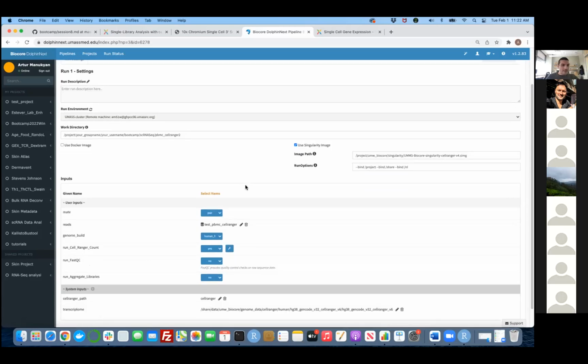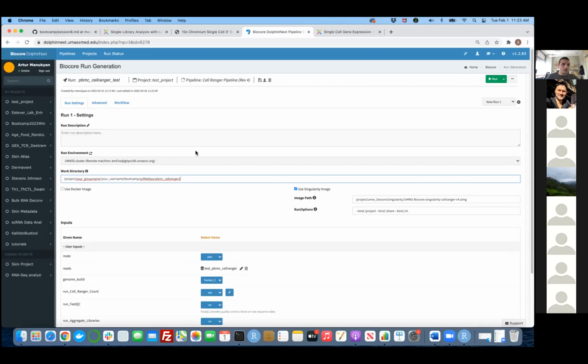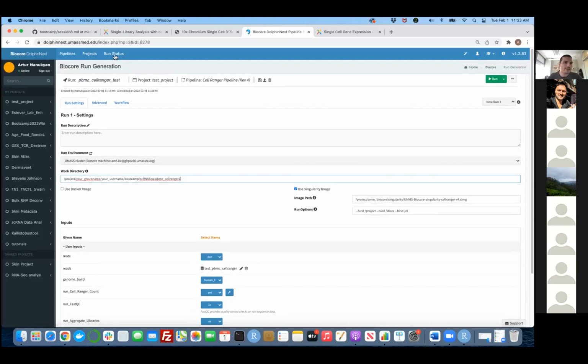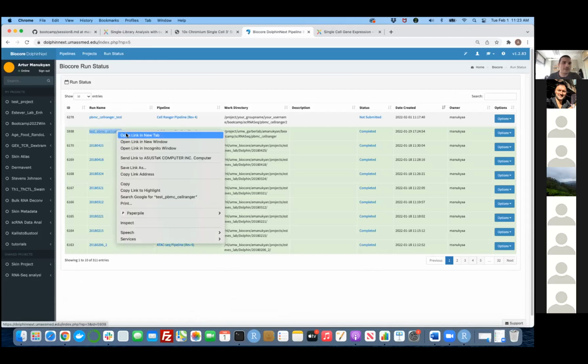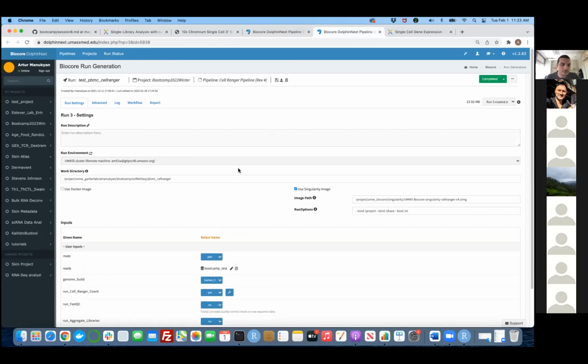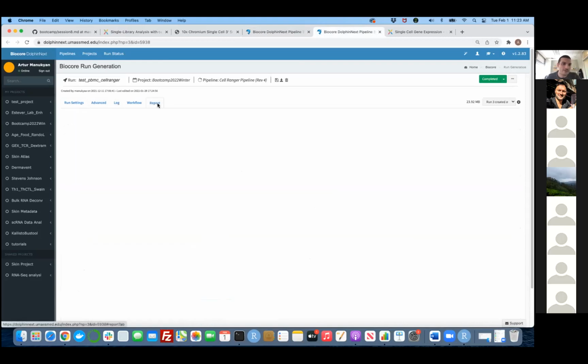Basically, this is a really good example because this pipeline will take 3 hours to run. So I'm not expecting that we're going to get the results now, but we are going to talk about the results in a different way. I already have a pipeline that has the results. So I'm just going to go to that and we're going to discuss the report. So this is a version where after 3 hours, your pipeline is done working and this report section has popped up.